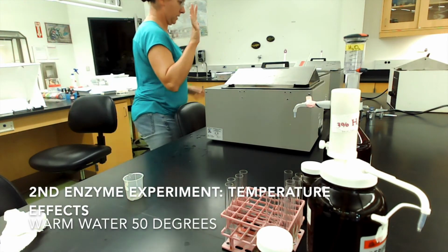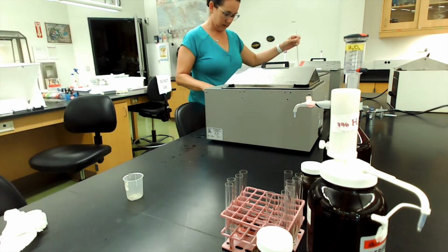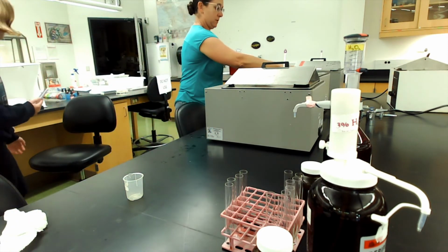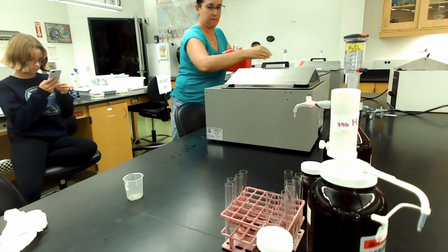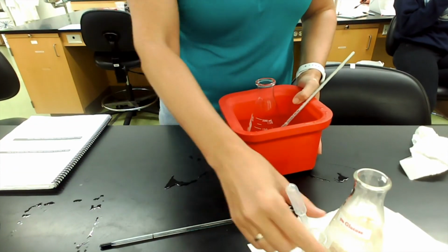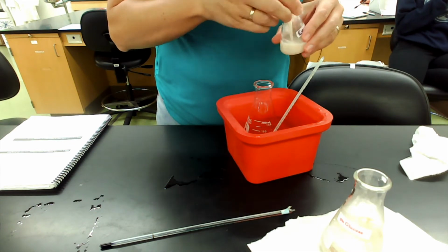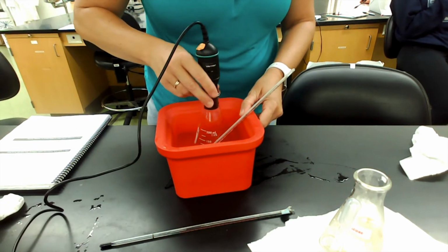So now I'm doing the warm water bath, which is currently at close to 50 degrees. I have filled up my little red bucket with some of that warm water. I'm going to put a thermometer in it, and I'm going to pour my warm hydrogen peroxide into my flask. I'm going to come over and add the enzyme to it again. Drops, swirl, swirl. Stick the magic wand in and go.